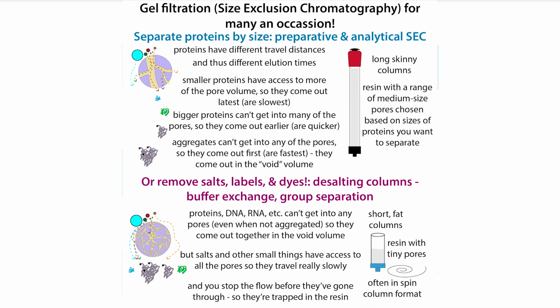And I'm talking a lot about dialysis. There are alternate methods. There are things like desalting columns, but again, you're going to be dealing with the same issues of needing to make sure that whatever you're putting your protein into is going to be a buffer that it actually likes. So don't remove all the salt if your protein can't handle those conditions, for example.